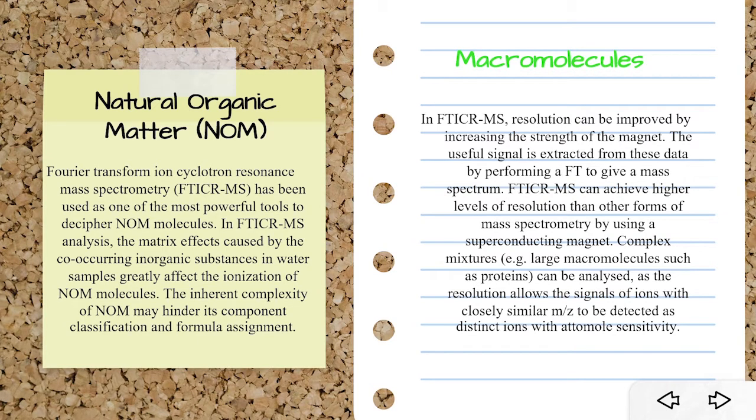With FTICR-MS, complex mixtures can be analyzed as the resolution allows the signals of ions with closely similar mass-to-charge ratios to be detected as distinct ions, with attomole sensitivity.